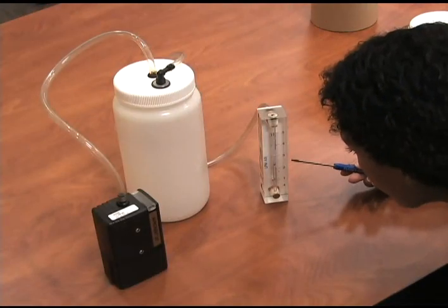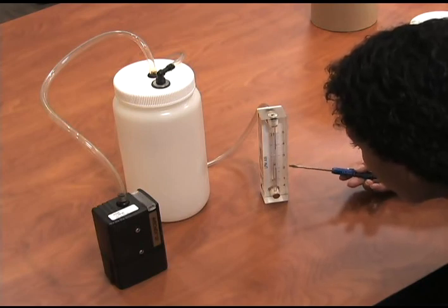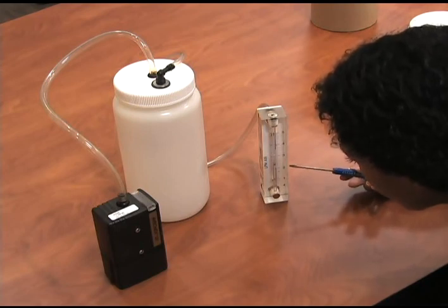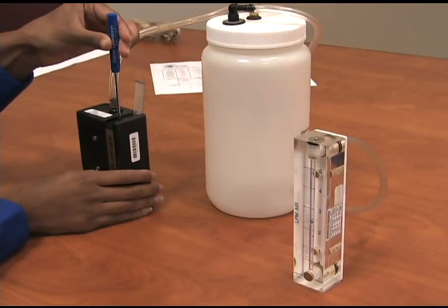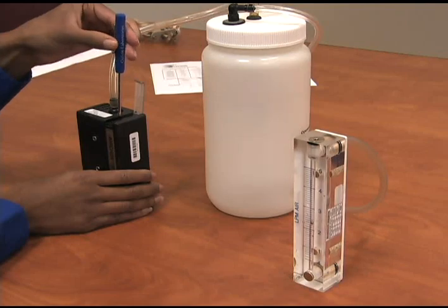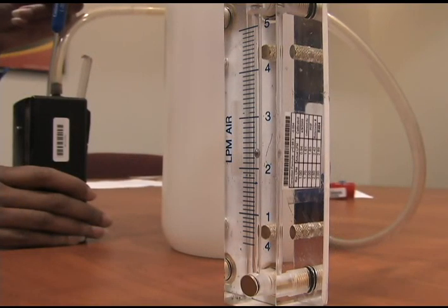With everything sitting on a level flat surface, check the ball float in the rotometer. Wait for the rotometer ball to stabilize prior to adjusting. Adjust the flow rate by turning the flow adjustment screw on the top of the pump until the rotometer indicates the desired flow.